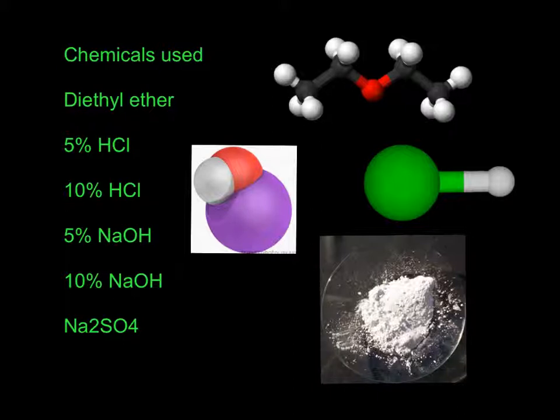Sodium hydroxide and hydrochloric acid are colorless liquids, and they may cause irritation of the eye and skin. Hydrochloric acid and sodium hydroxide should be disposed of in the sink with water. Sodium sulfate was the drying agent we used in the isolation of the neutral component. It is a white solid chemical. It may cause irritation to the eye, and it should go into the trash can.